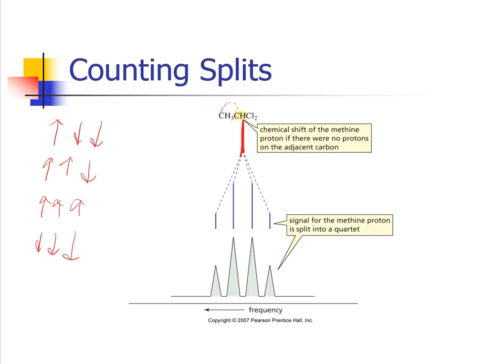So here we see different possibilities, different opportunities for these protons to spin. And if they're spinning with the main signal, then it begins to amplify that signal to higher and higher ppms. Not by much, just a little bit. But if they go against that spin or that signal, then they will go lower and lower from that main signal, and they will go lower in ppms on the delta scale. So we see this nice spread.